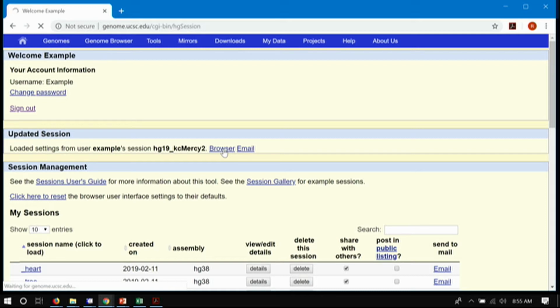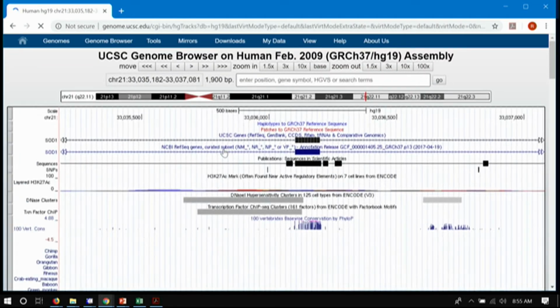Okay, I have a little buzzing. Did people find it that wanted to? Do we have to sign in? You do not have to sign in.